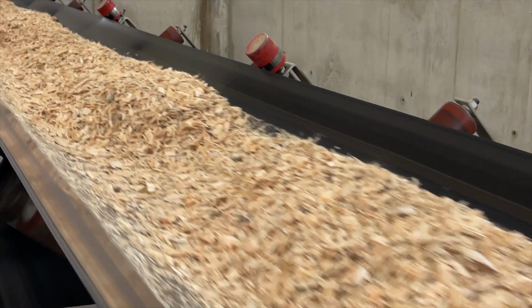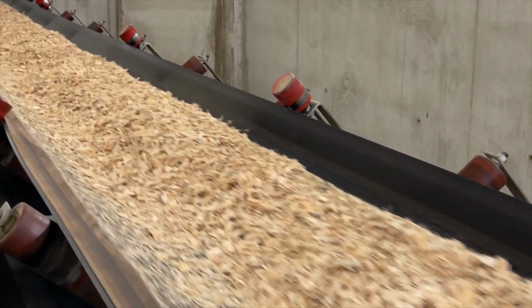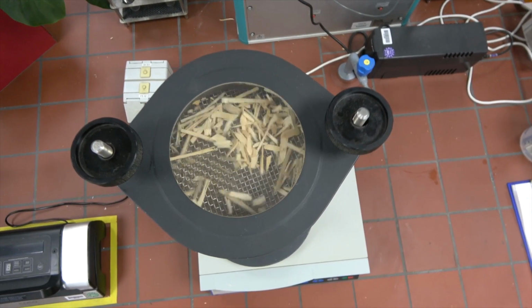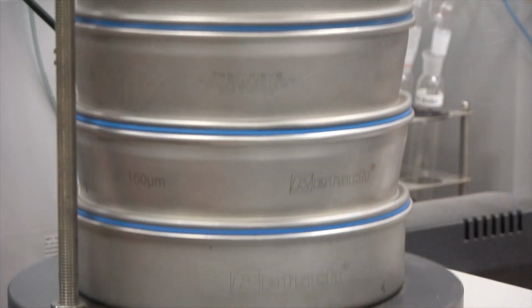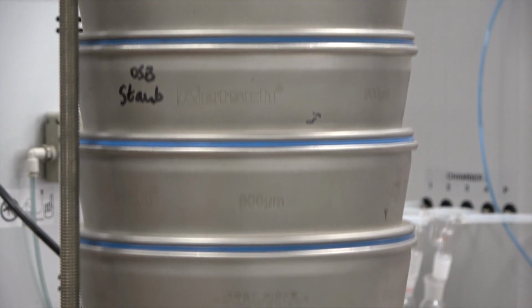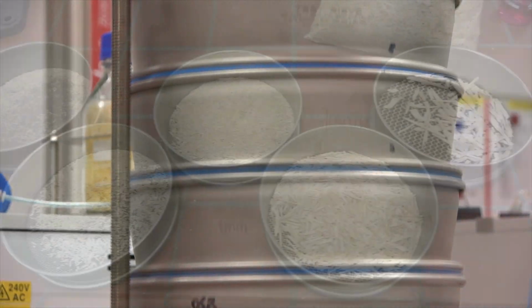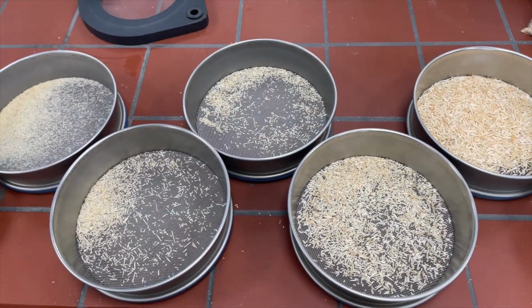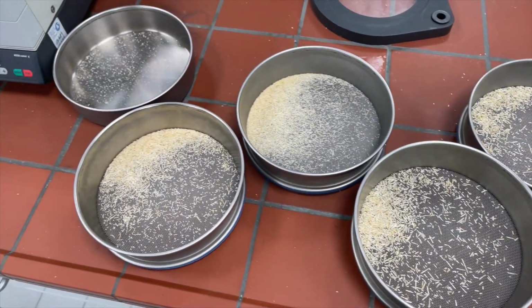Let's first look at what the conventional laboratory work looks like for particle quality control. The most common is the sieving method. A particle sample is taken after the knife ring flaker and sieved in the laboratory. The weight of the individual fractions is then determined. The result, however, only indicates the width of the particles. Another disadvantage is the time required for sieving and the subsequent analysis. Additionally, the measuring results depend to a large extent on the sieving time.